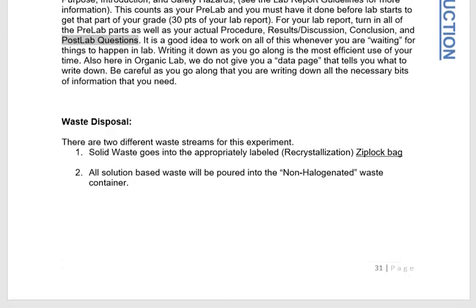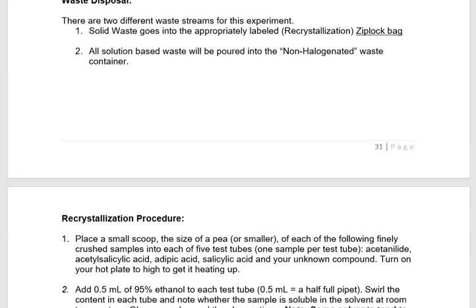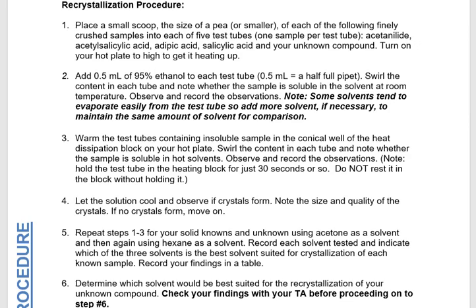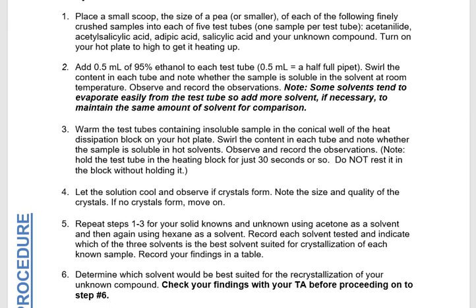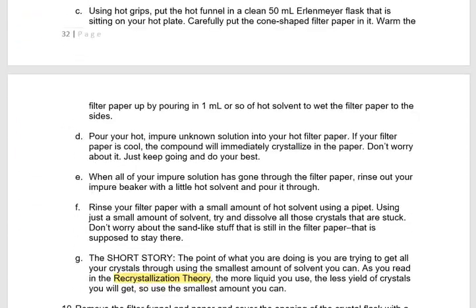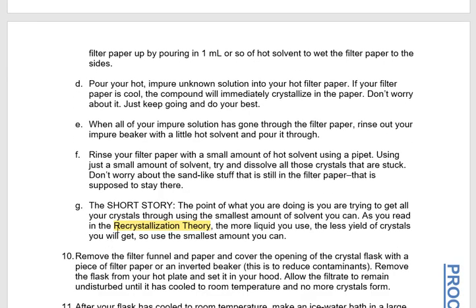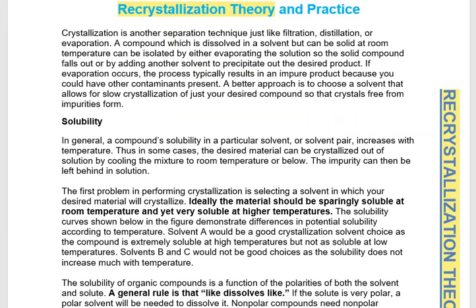As you go through, pay attention to this procedure. In a nutshell, we'll talk about what's going on here. You'll see in the procedure it references this recrystallization theory that you need to be prepared for. So, recrystallization theory: what are we really talking about?